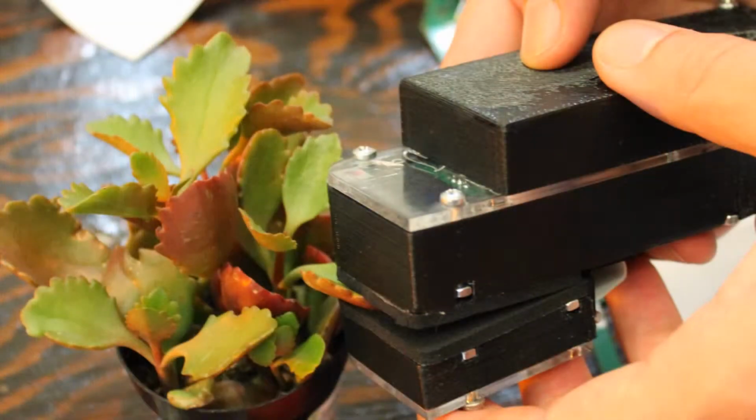The device itself costs between $50 and $125 to make. The rest of the tools are all free.